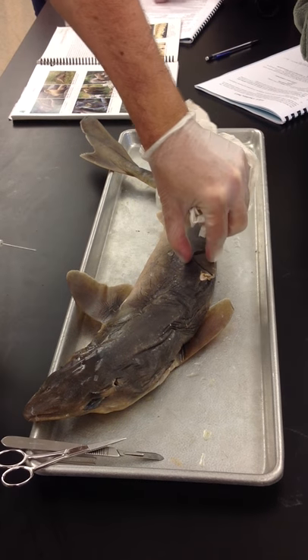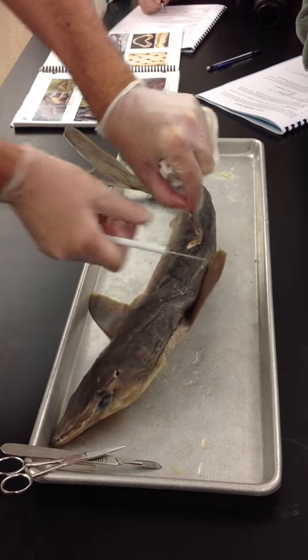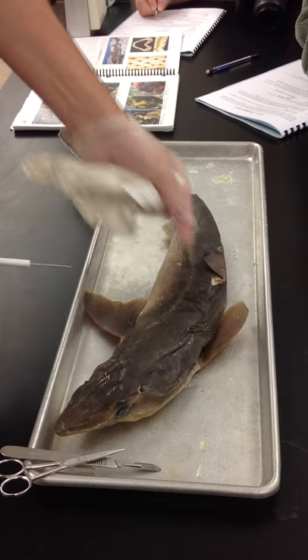The anterior dorsal fin is the standard dorsal fin when you think of a shark's dorsal fin cutting through the water. Anterior towards the head, dorsal on the back — so this is the anterior dorsal fin.